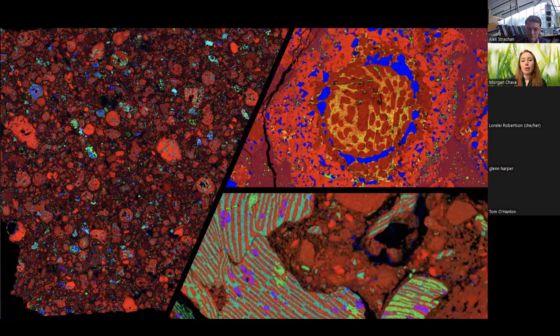And so these are examples of some of the meteorites that we have been imaging. They're looking at the formation of the solar system, formation of planets, and what we can learn about that from the tiny little things that are flying around our planet, or that have been collected from some other mission flying further out. And so they're looking at the compositions, and what that means for how various things will be conglomerates, how they will collect. There's obviously a very interesting pattern on the bottom right, almost a stratigraphy, sort of layering. What would have created that? And then trying to learn about the earliest materials in the solar system.